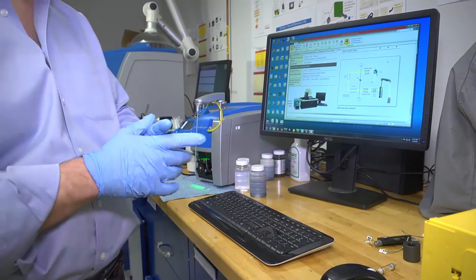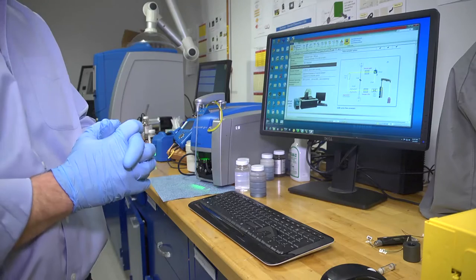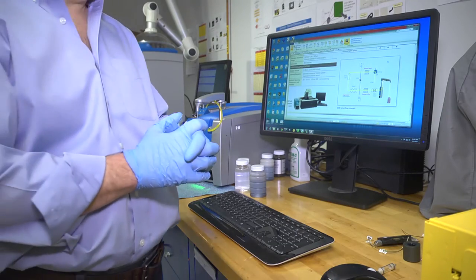The first piece of instrumentation is our ferrous monitor, which gives a particle count for all ferrous particles 25 microns and larger.